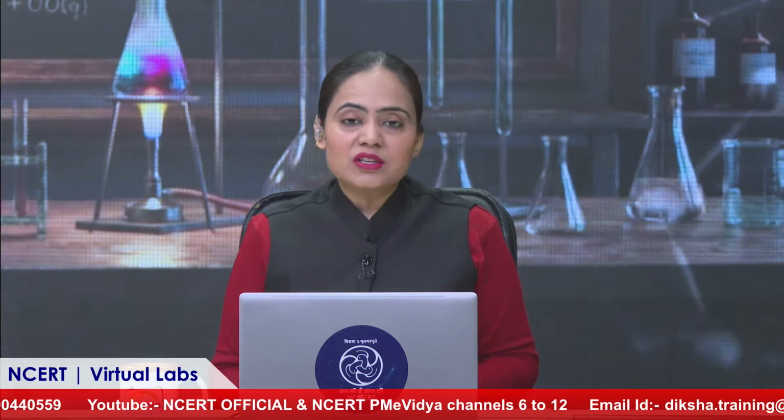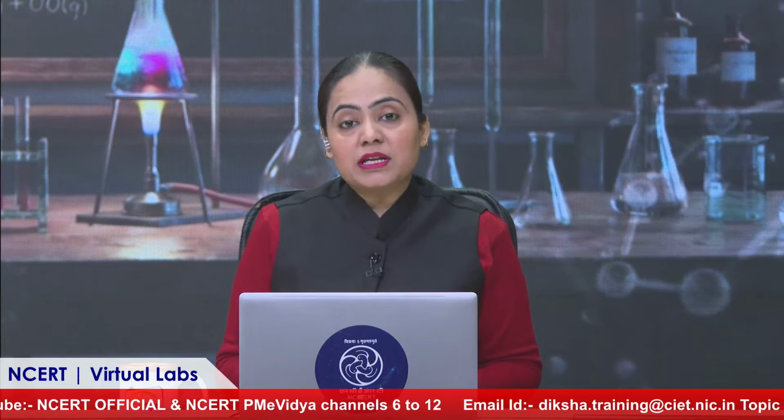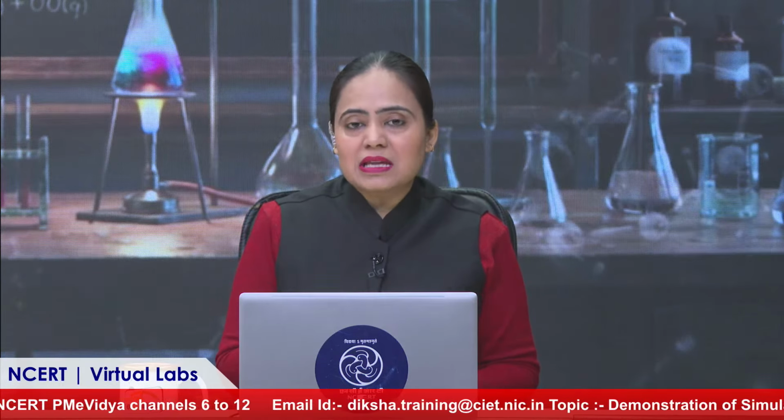Now, how it actually benefits you. So there is no rush. You can practice as much as you want. Secondly, it's very safe, and you can actually protect yourself from the hazardous chemicals because you have already practiced the simulations at your place, and now in the laboratory you know what precautions you need to take.